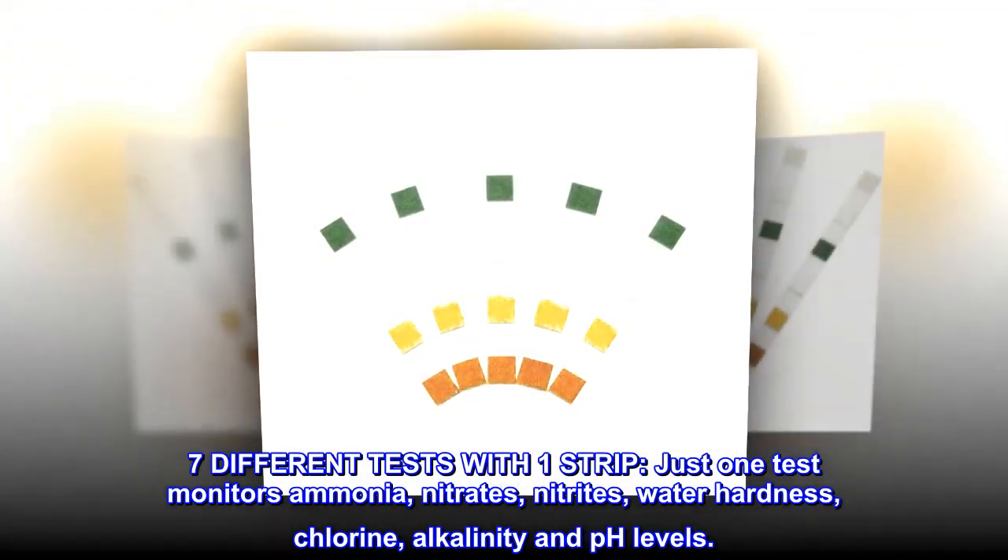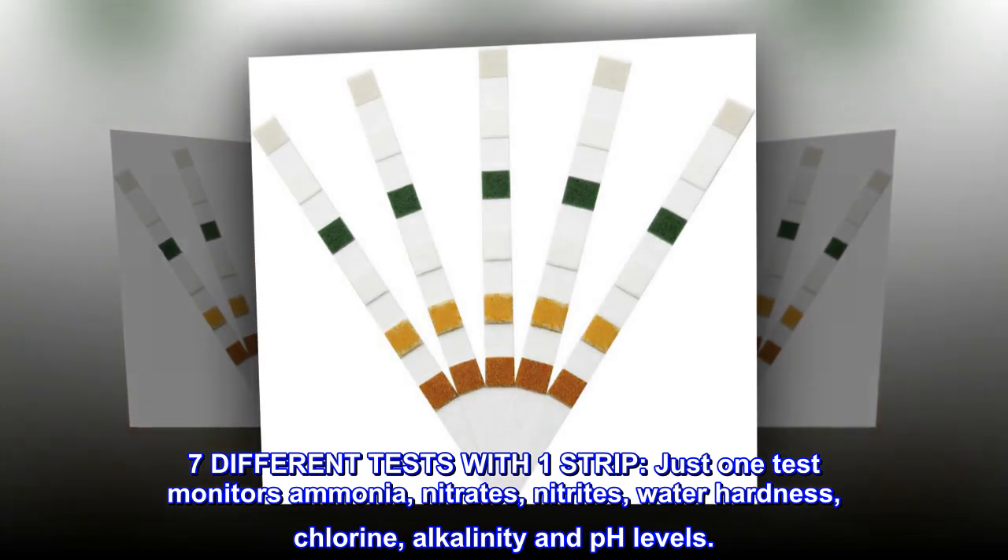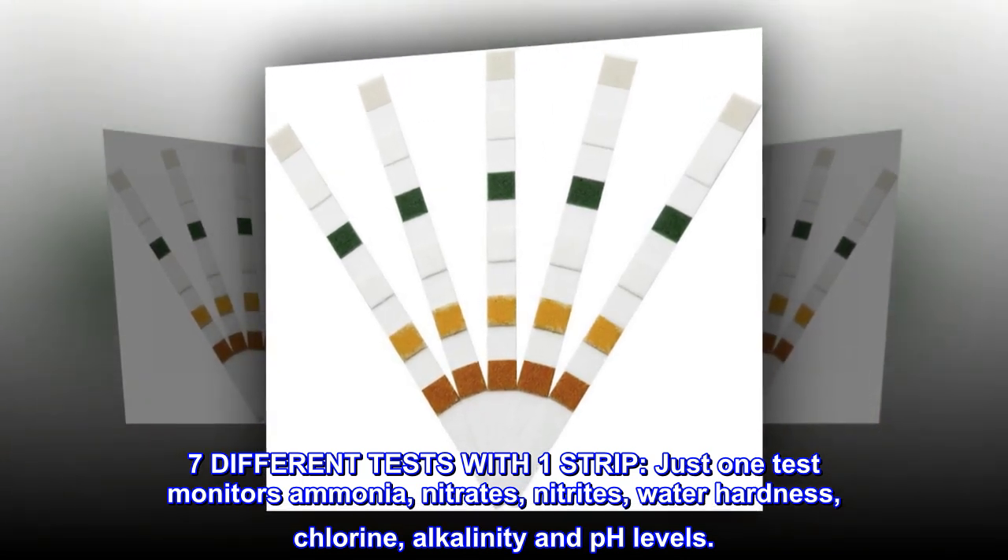Seven different tests with one strip. Just one test monitors ammonia, nitrates, nitrites, water hardness, chlorine, alkalinity and pH levels.